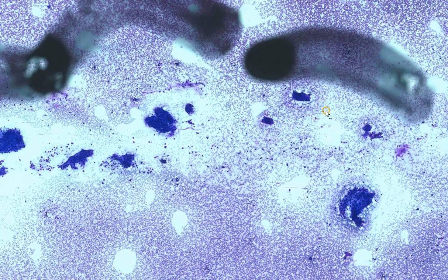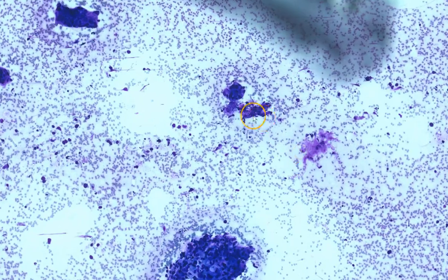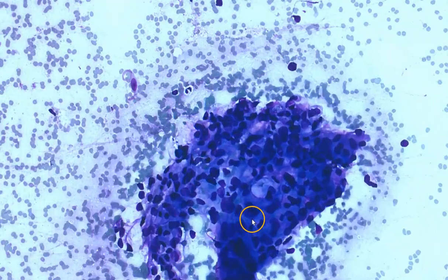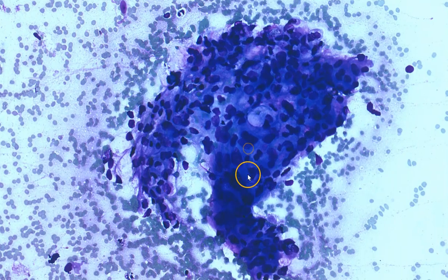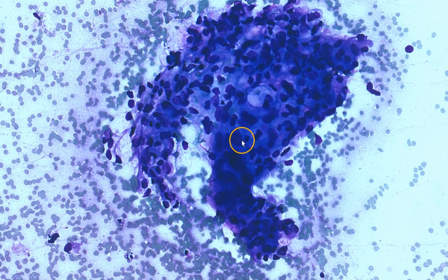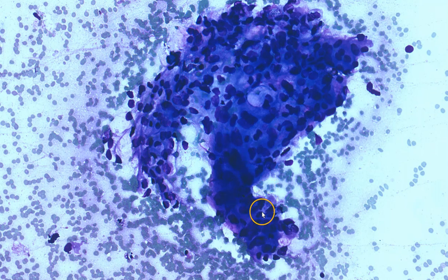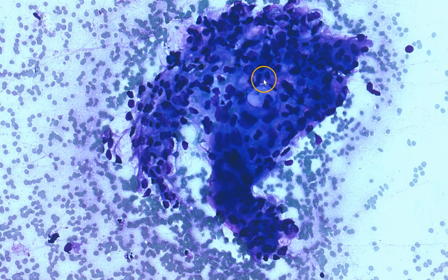Moving downwards, we can see more lesional tissue here. Some of the nuclei exhibit irregular nuclear membranes, and we can see that the cytoplasm varies quite a bit in volume. In some areas it is quite low; in other areas the cells have quite abundant cytoplasm. It is not uncommon to have quite a low NC ratio in pancreatic adenocarcinoma cells.